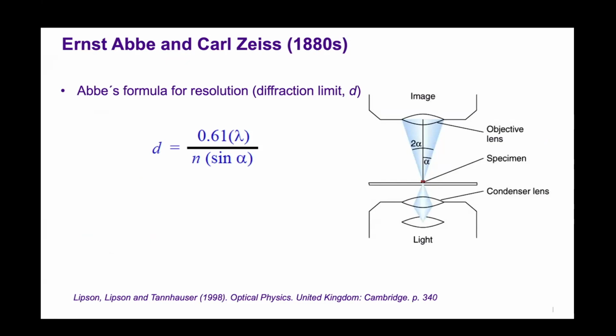That means if we have a certain region of the electromagnetic spectrum, we can calculate the theoretical limit, how small an object can be seen, or what is the smallest distance that can be resolved between two objects. That is the resolution. I have two sticks, but I want to know how far apart they are.